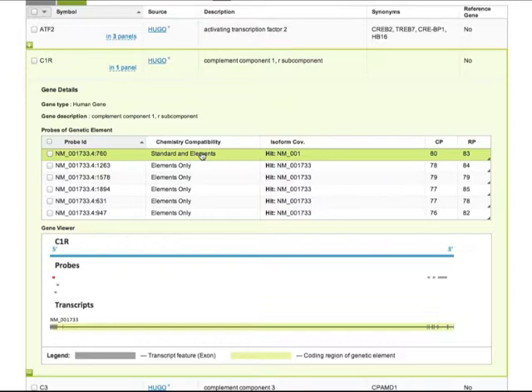sets only. If you do want to order a code set with elements only probes as a standard code set, then export the code set as I'll show later, and simply contact sales with the exported spreadsheet, letting them know that you would prefer a standard code set.